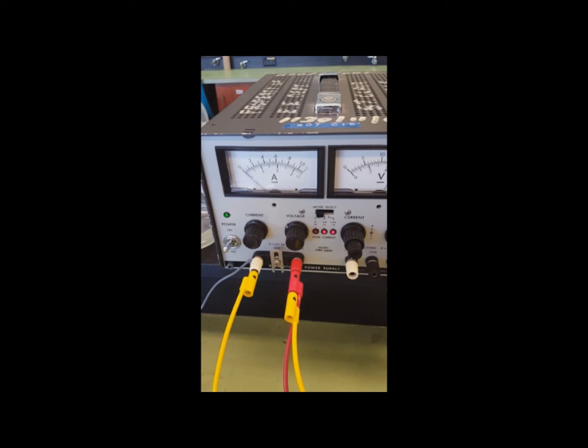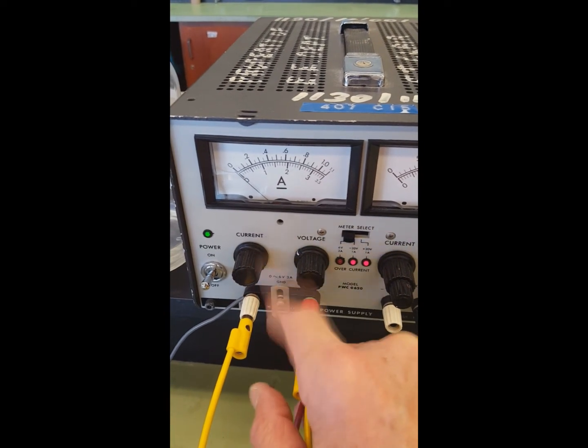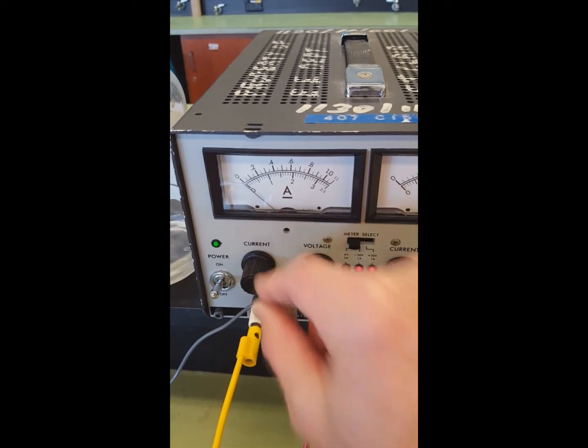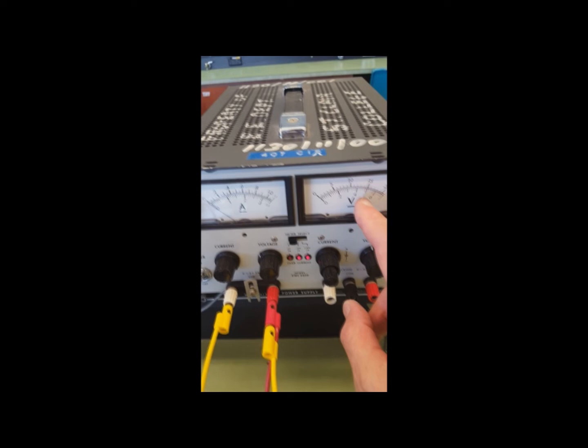I tried raising and lowering the copper anode plate, and it really made no difference to the rate because there's a lot of surface there. The restricting point is the surface area of the copper strands of the wire at the cathode. So you turn the current dial fully clockwise, making full current available. Then you start with the voltage fully counterclockwise at the 0 position, and once your instructor has checked first that it's acceptably wired, turn the power supply on and gradually turn the voltage up to 5 volts. Around about 1 volt you'll start to see some current start to flow, and as you approach 5 volts the current will reach anywhere from 60 to 100 milliamps.